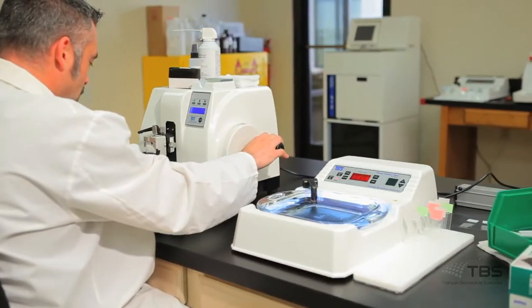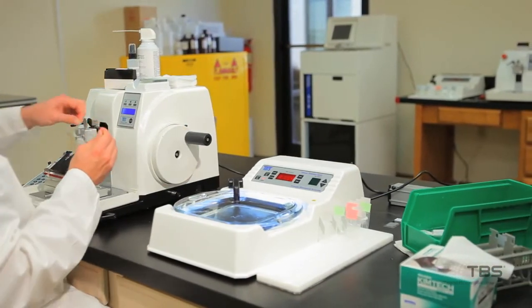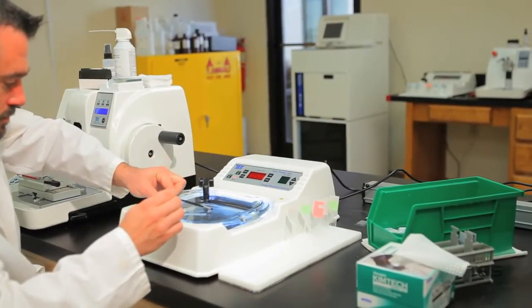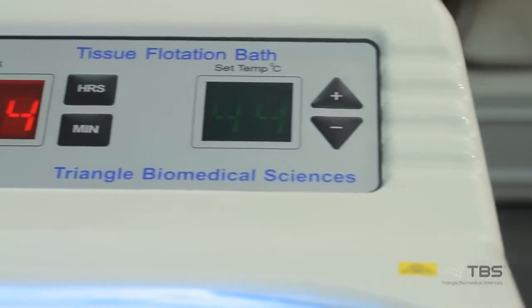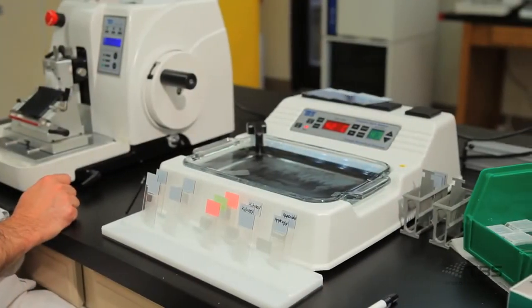All TBS baths also include a Kydex housing, recessed LED lighting, and a non-mechanical temperature probe. The Kydex housing is heat resistant, durable, and resists denting, rusting, and scratching.